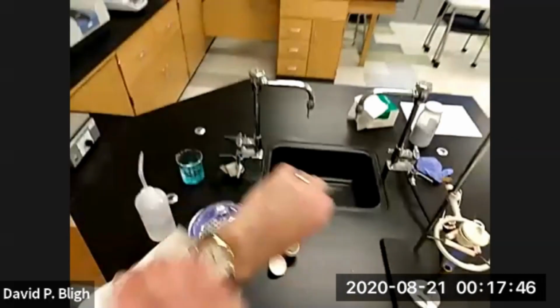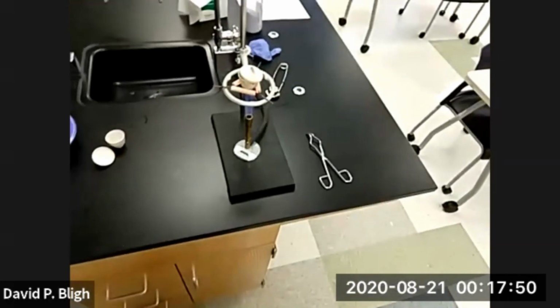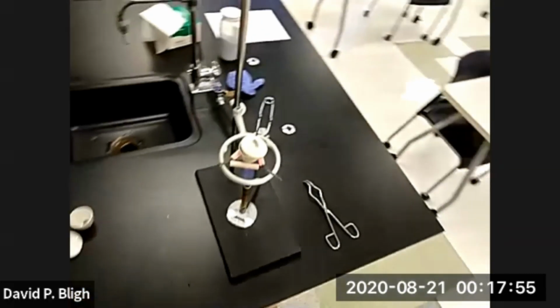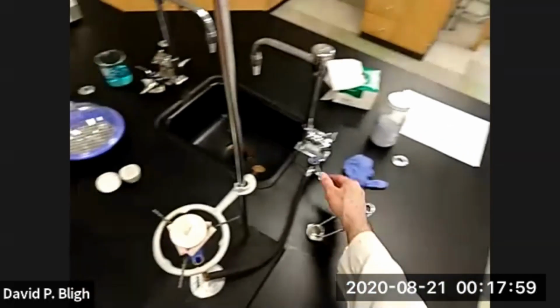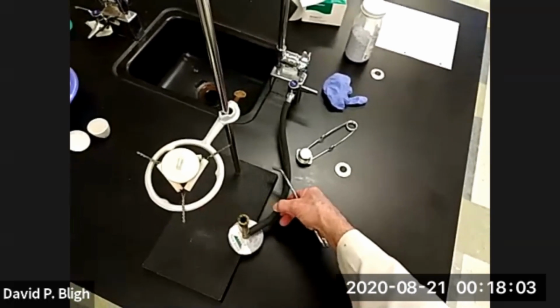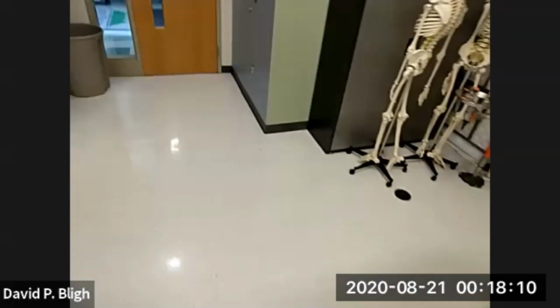All right, in the interest of time, we've already gone 20 minutes. In the interest of time, let's take this one off and let it cool. We're through with the burner. We can shut it down, set it aside, let that cool for a minute. And while it's doing that, we'll turn off the main gas.